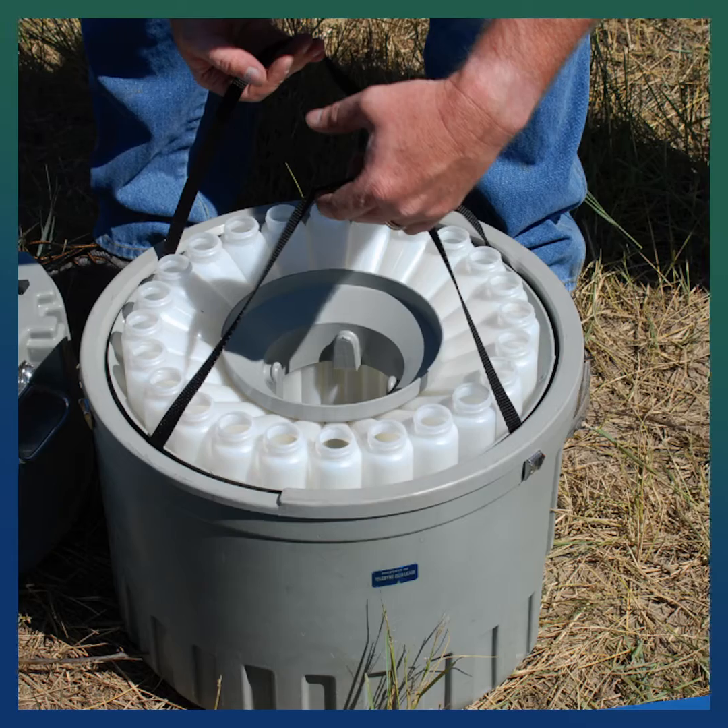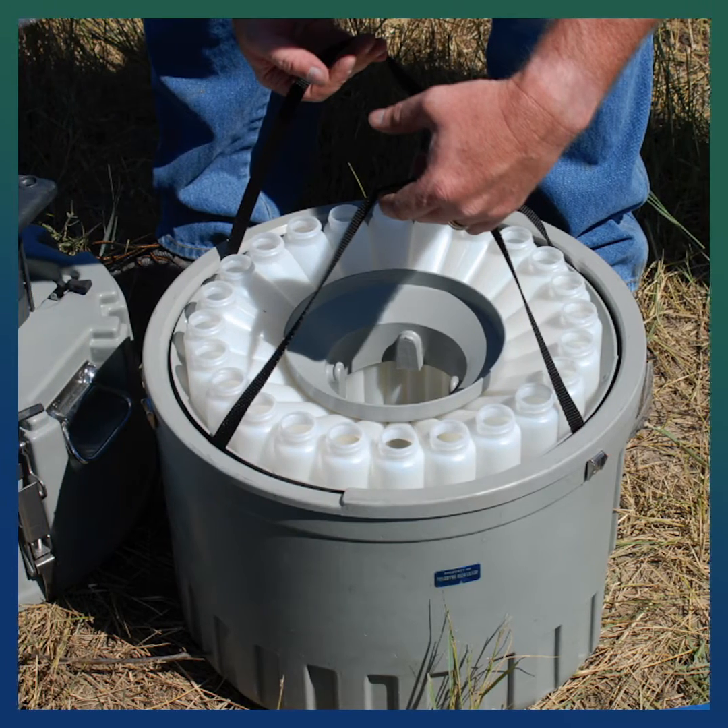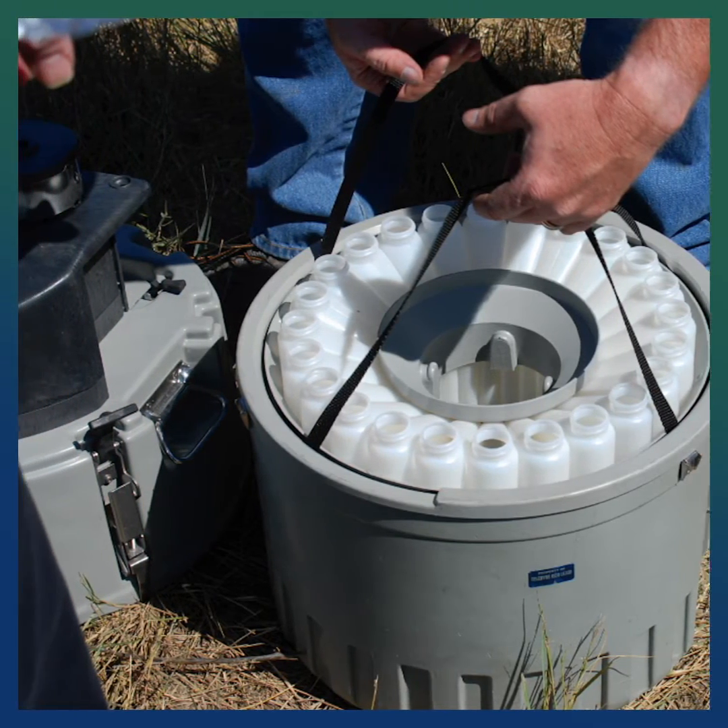Did you know the 6712 features a vacuum formed ABS plastic shell to withstand exposure and abuse? With its tapered design and 20-inch diameter, manhole installation and removal are an ease.